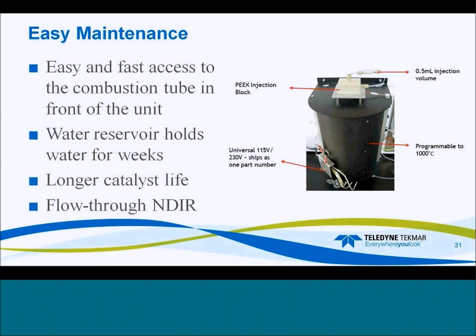Also, with running salts, lots of rinses are nice. So you can run a rinse, or you can run a DI water. If you run a rinse, it comes right out of that water reservoir, and because it is pressurized, it saves it from any laboratory contamination. So you don't have to change it every day. You only have to change it when it's empty. So that's the easy maintenance. Change your combustion tube easily, the water you don't have to change every day, and the catalyst is going to last much longer.